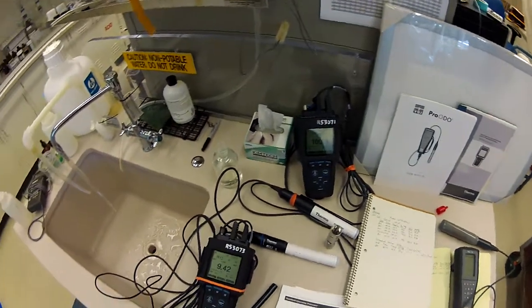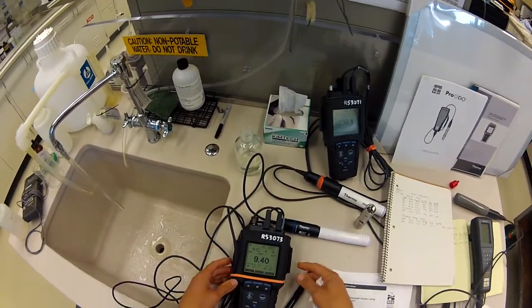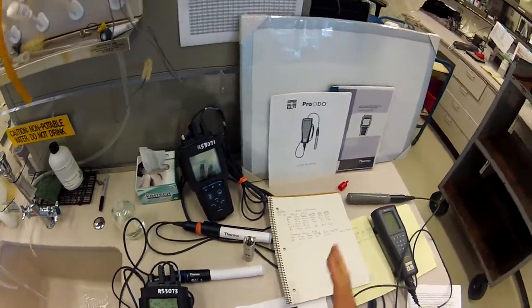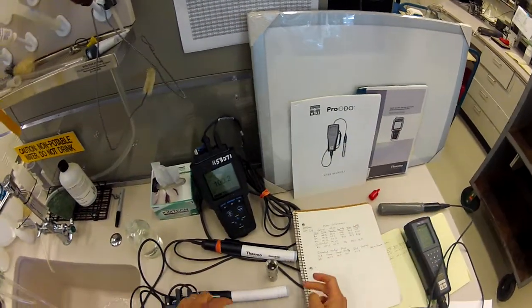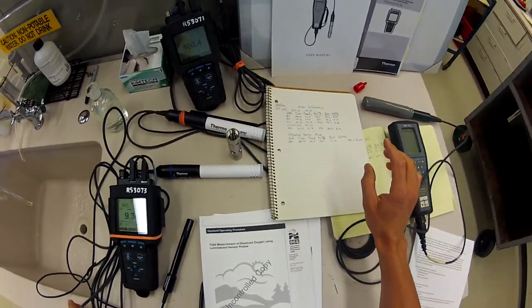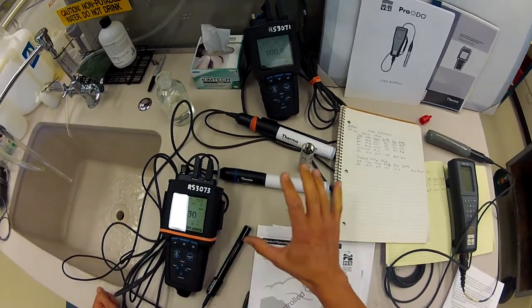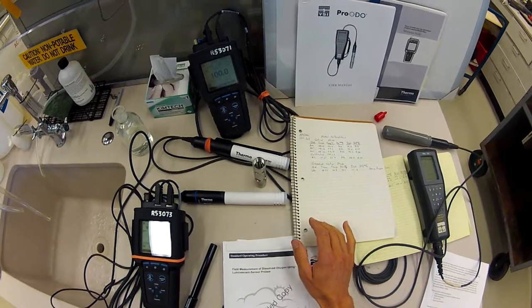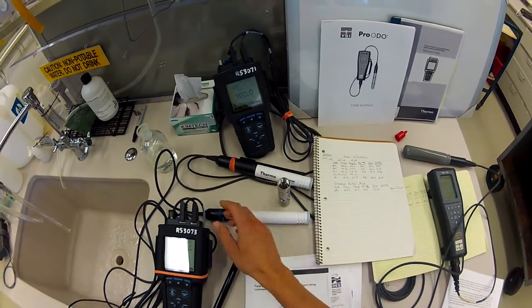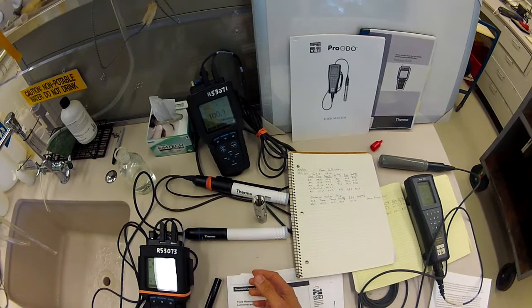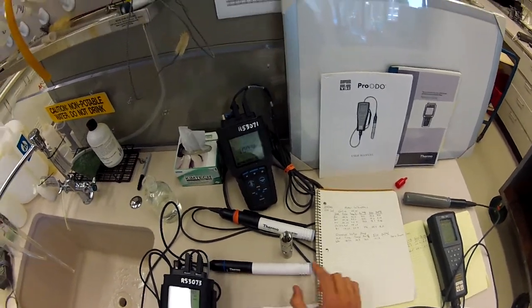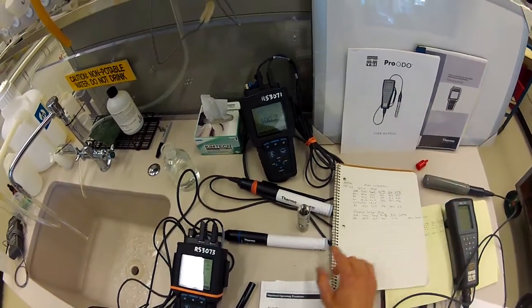So now we're going to wait for that to reach equilibrium. We're not going to turn on elevator music and wait - we're going to move on to these others. But you should keep in mind the manual will tell you approximately how long it's going to take to equilibrate in your chambers here. But the thing to keep in mind is that that generally is based on the meter and air being at the same temperature or close to it, within a degree or two. If you do not have those conditions, for example if you take a cold meter in from a rig and bring it into the lab or vice versa in the summertime, it's going to take more than 10 minutes as they recommend in these manuals - it's going to take 15 minutes, it's going to take a half an hour or maybe more to get a stable reading.